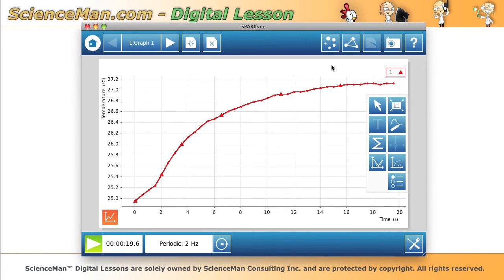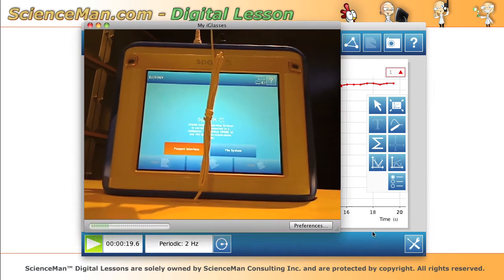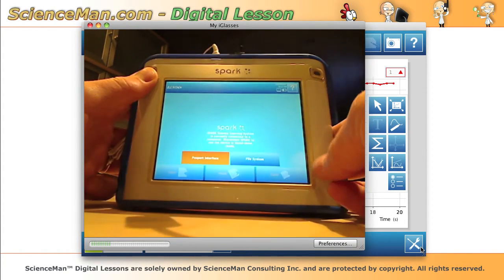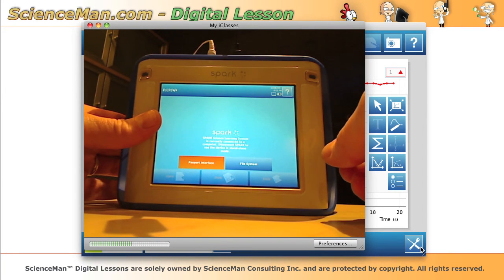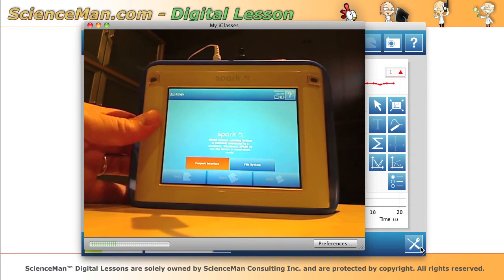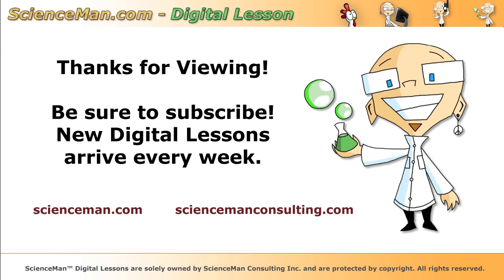On the whole, when you take a look at this entire system — the software, the SPARK unit itself which is really rugged, with a great bright five-and-a-half inch touch-sensitive screen that is really easy to use, good long battery life, and easy-to-plug-in sensors — I have to give this whole system five stars out of five. It's quite an impressive unit and I would wholeheartedly recommend it. Thank you very much for viewing this digital lesson.